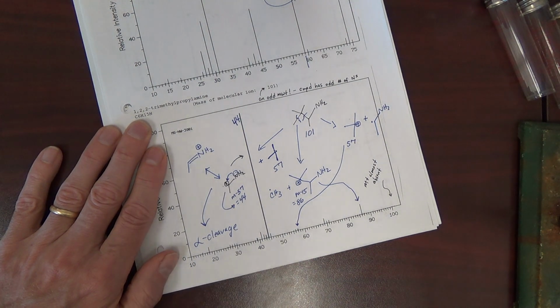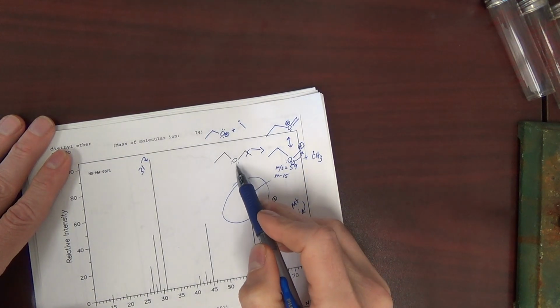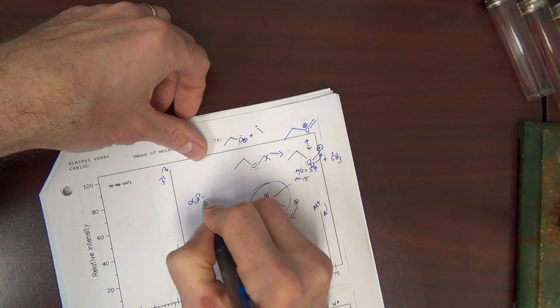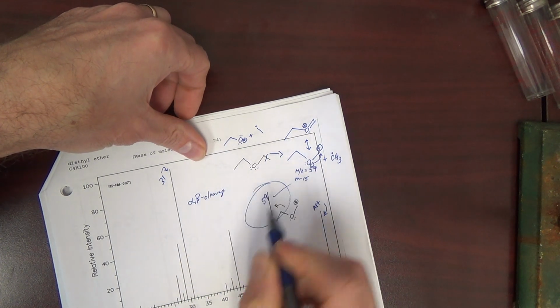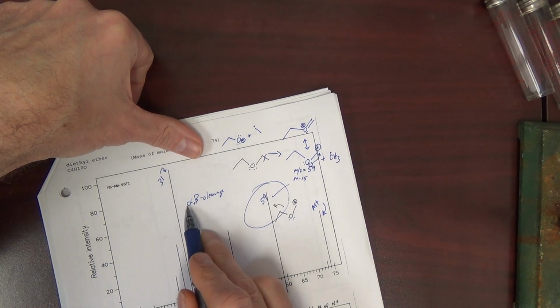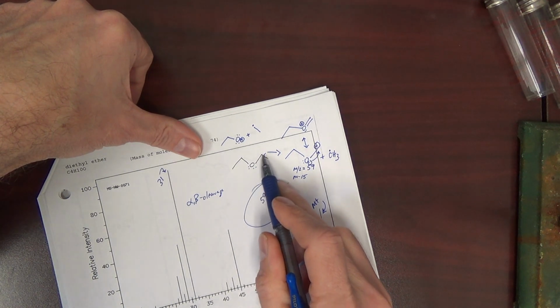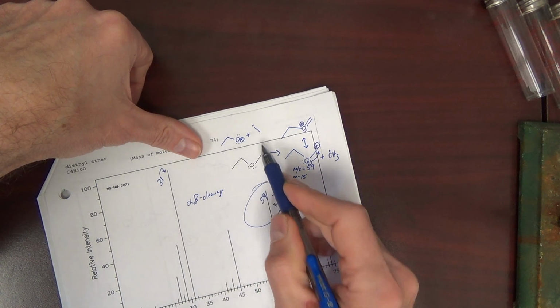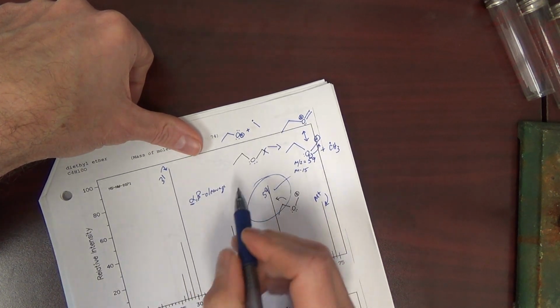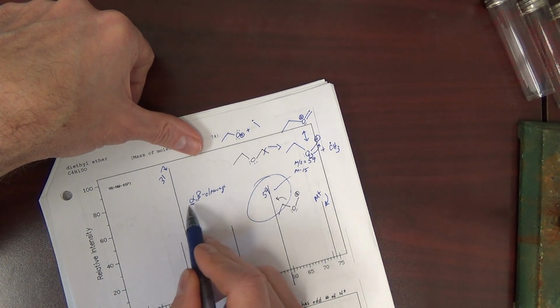The alpha comes from, if we look up here, it's really shortened for alpha beta cleavage. We're really cleaving between the first atom and the second atom after the functional group. First one's called alpha, next one's beta, and we cleave between them. But we just quote the alpha, sort of like when we quote the positioning of an alkene. We just quote the first number in the nomenclature.